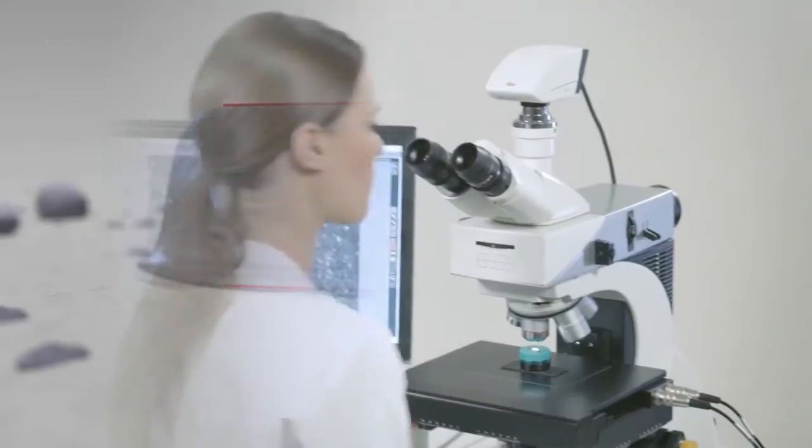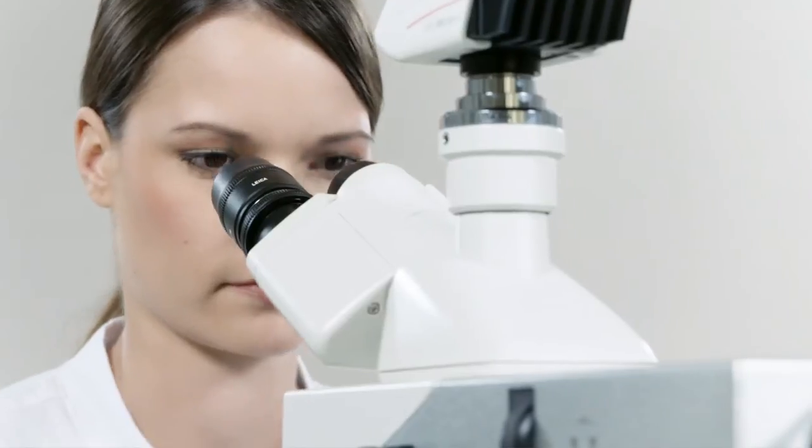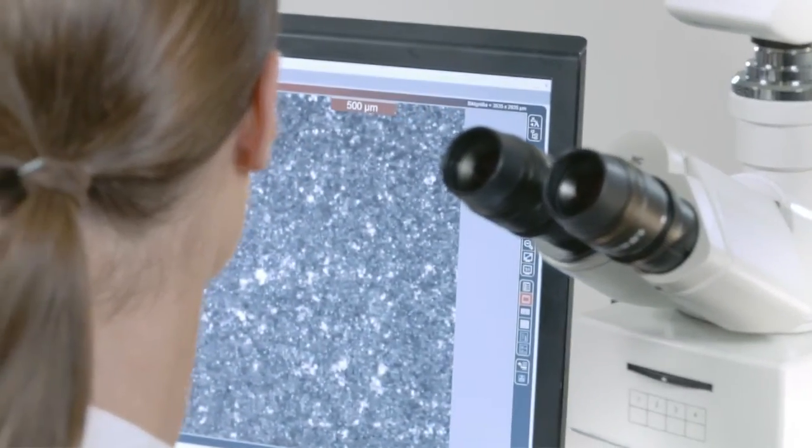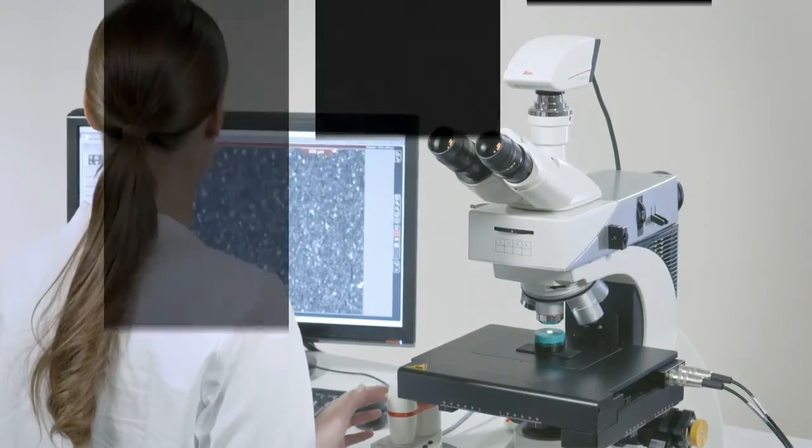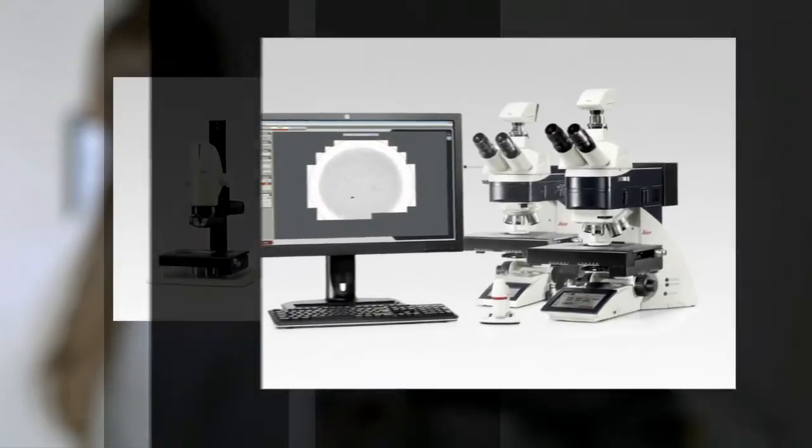Of course, the Leica DM 2700M also delivers all the benefits you would expect from a microscope by Leica Microsystems and is particularly suited for materials testing, for example in metallography. The outstanding accuracy of this microscope is enhanced by full automation.